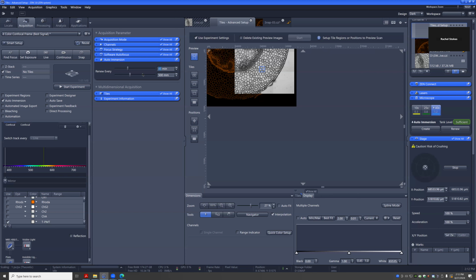The main thing I think this is designed for is plates, right? If we're going across a plate and we need more immersion water, those are going to be the biggest jumps. But on a single slide, for example, as I was moving around, it stays within the immersion for pretty much anywhere on this slide. So it doesn't really seem to be the case. If you wanted to do group step all the way up. I like the tiny drop that I usually use.